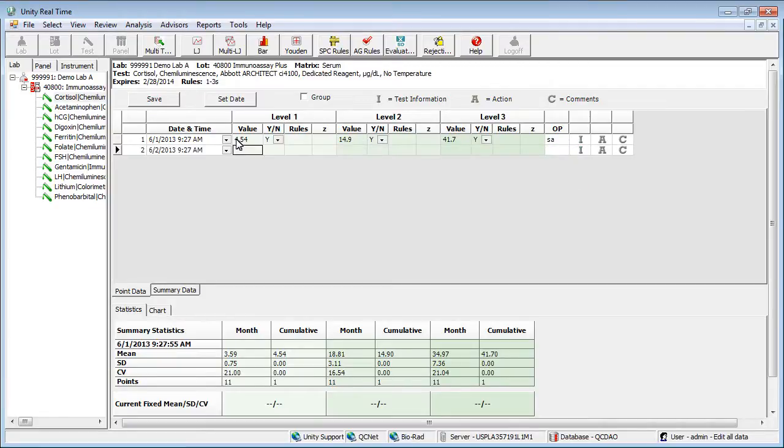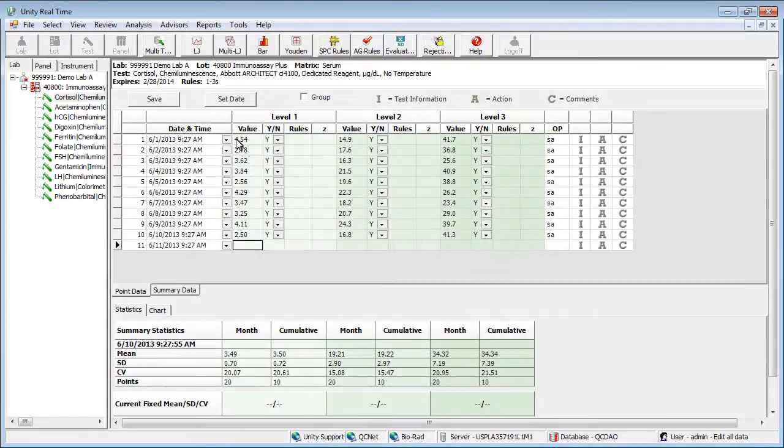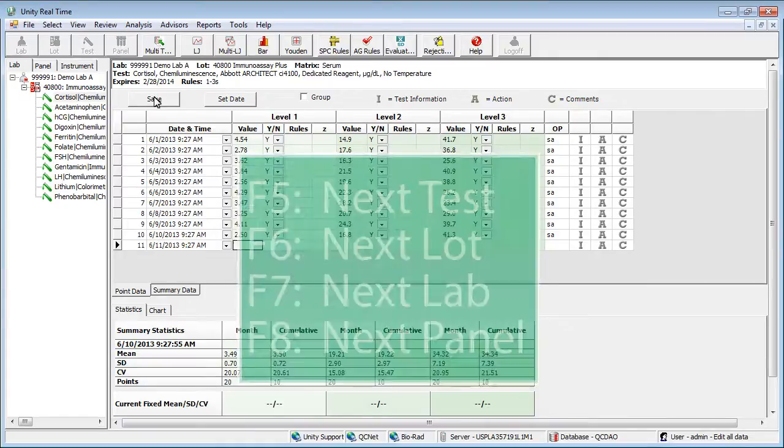Pressing tab at the end of a row adds a new row. Data will be evaluated when the line is complete and a new line is selected. After entering all of your data, click Save. You can use the function key to move to the next item.